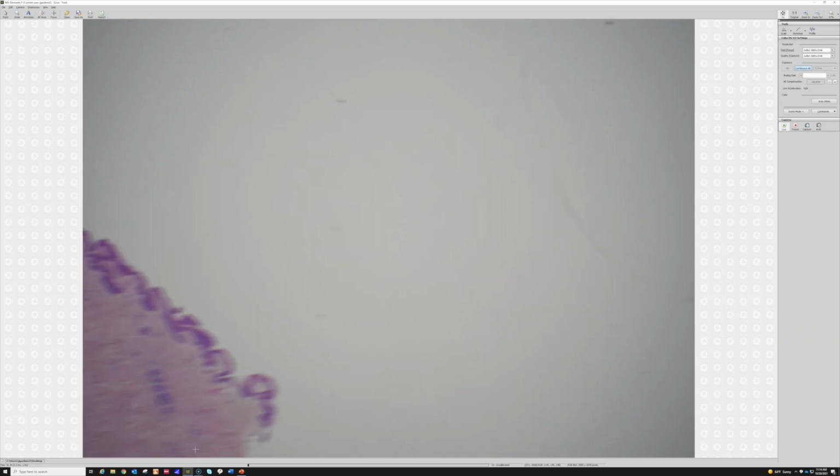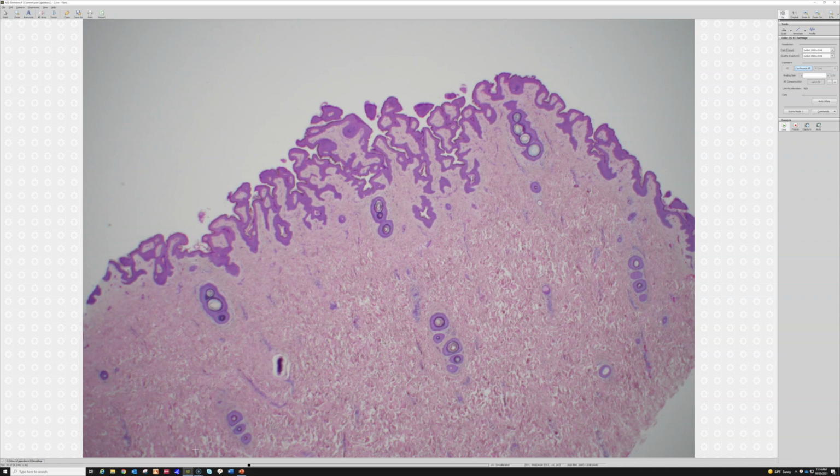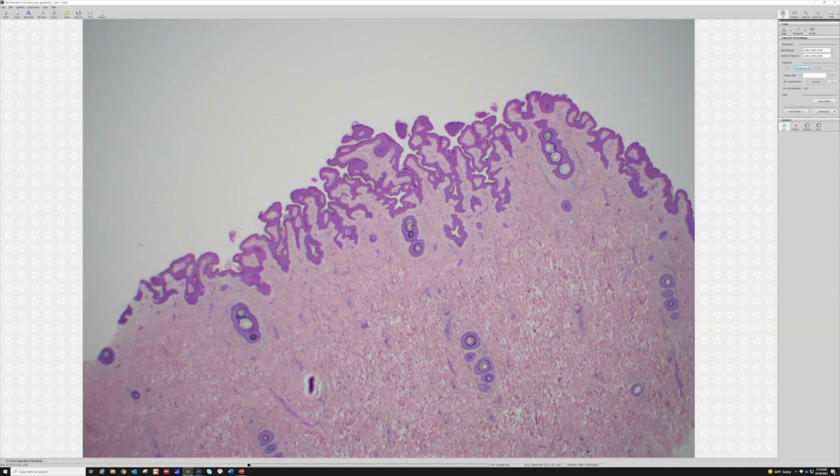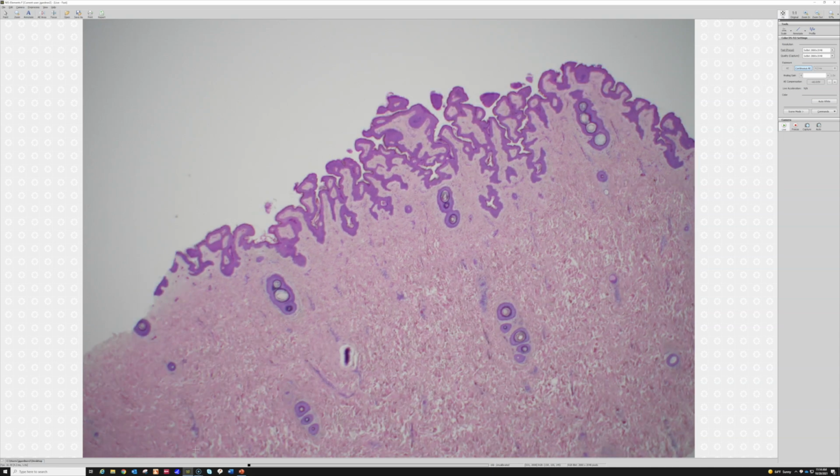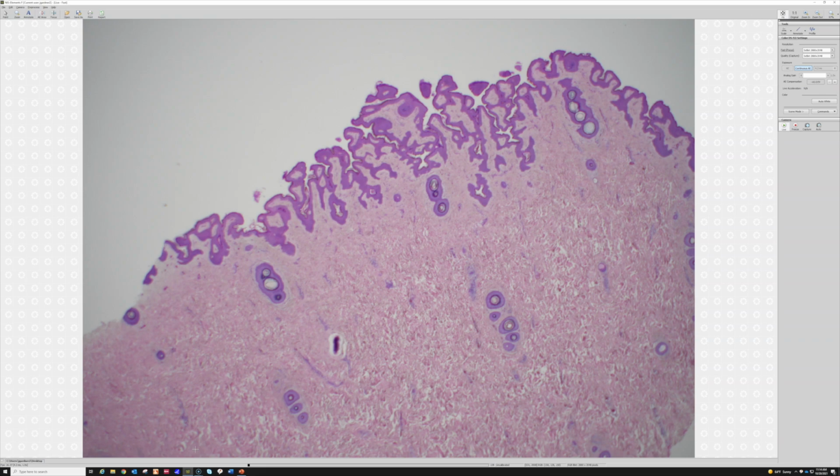All right, let's look at this piece of skin. This looks really weird up here because it's totally folded tissue. The skin's folded over and wrinkled, and so it gives us this crazy looking epidermis, but that's all an artifact of sectioning in the laboratory.